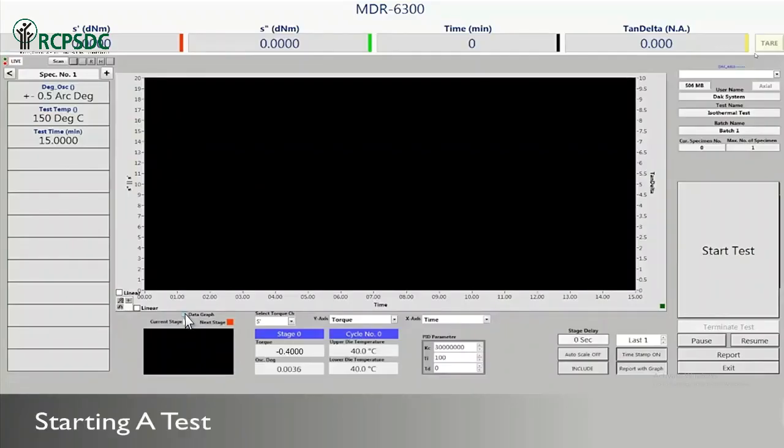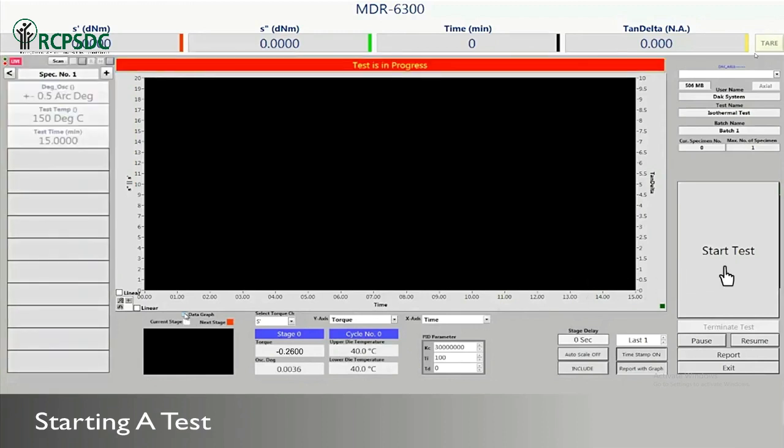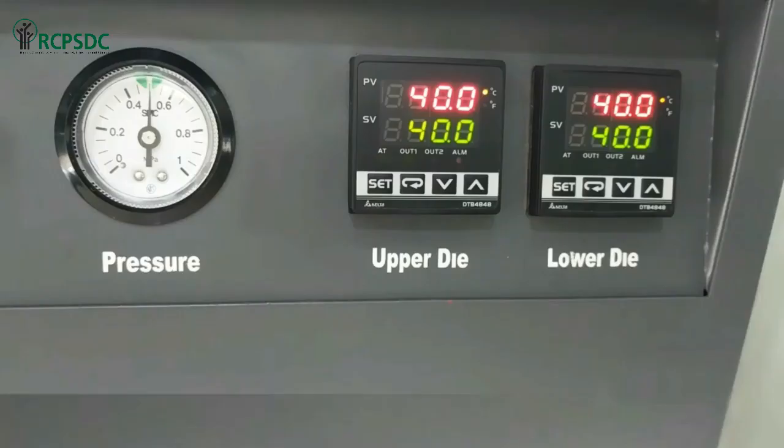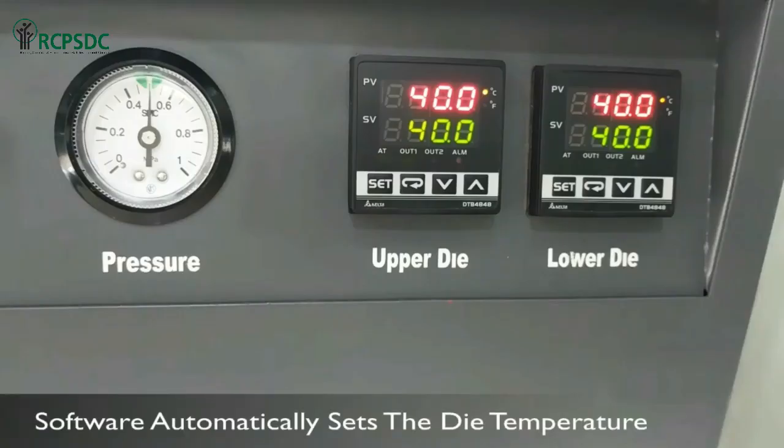Now test software interface will open. You need to click start test tab for starting the test. The software will automatically set the pressure and temperature of the upper and lower die.